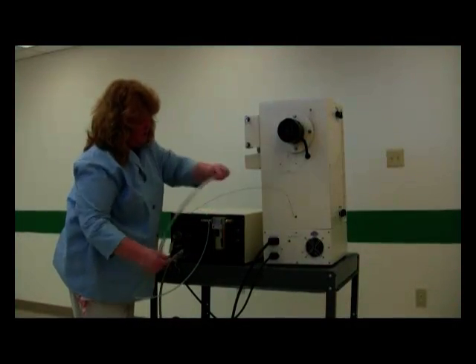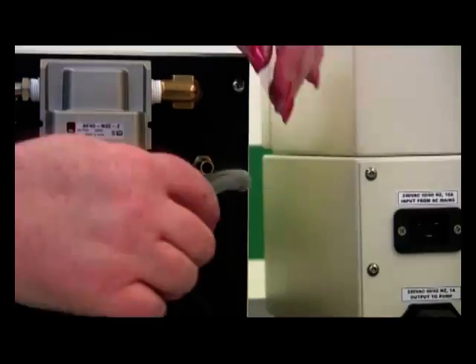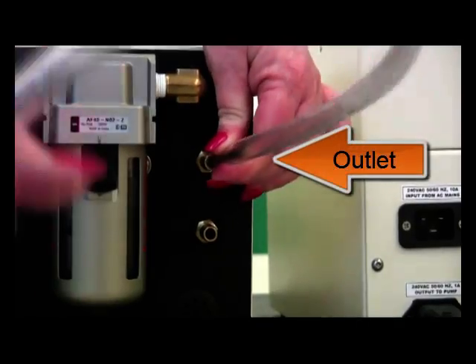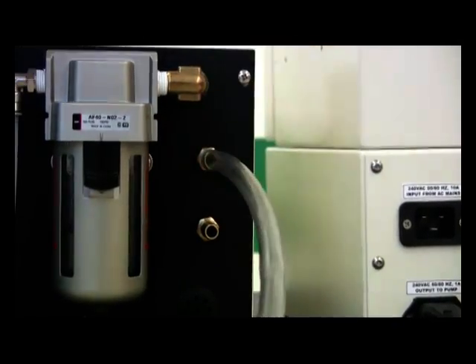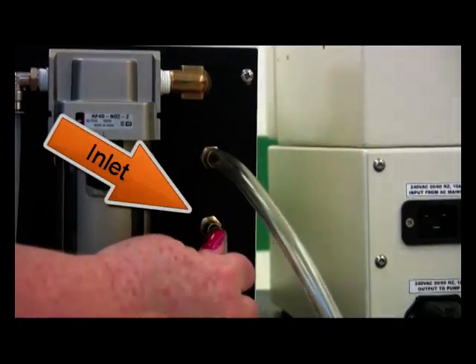Last, hook the inlet and outlet hoses to and from your chiller to the inlet and outlet on the pump.